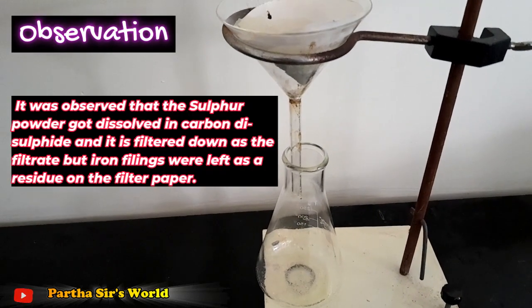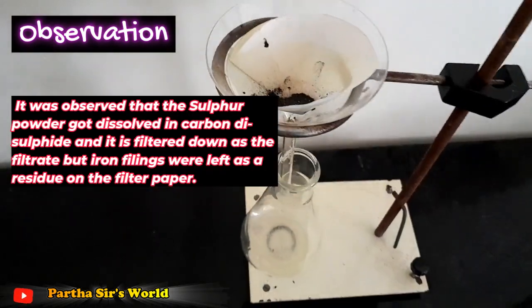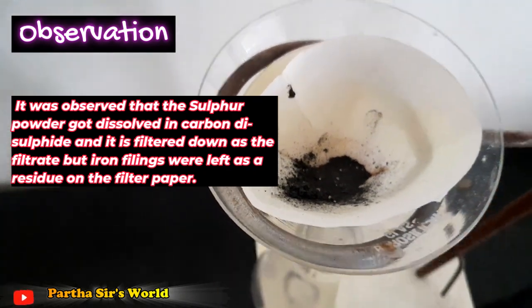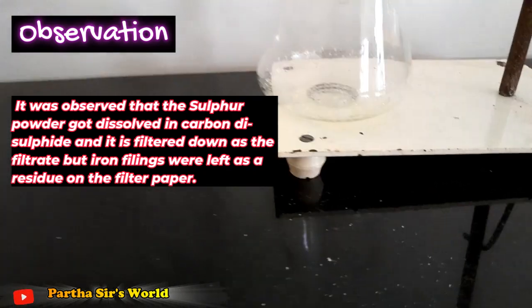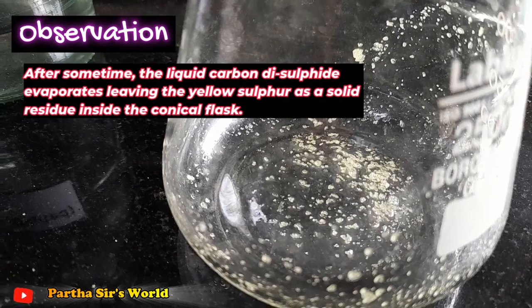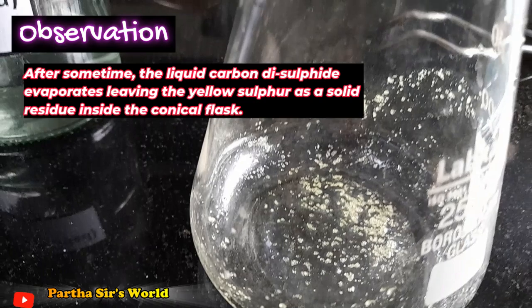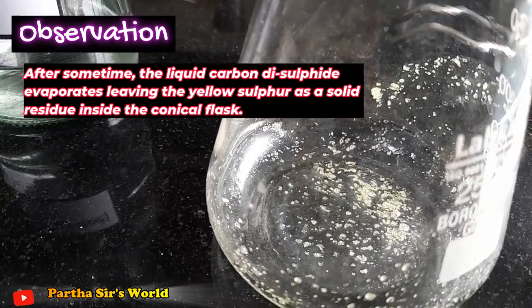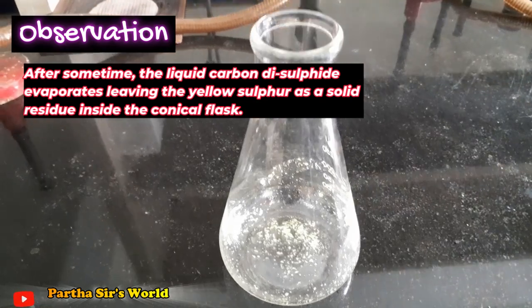It was observed that the sulfur powder got dissolved in carbon disulfide and filtered down as the filtrate, but iron filings were left as the residue on the filter paper. After some time, the liquid carbon disulfide evaporates, leaving the yellow sulfur as a solid residue inside the conical flask.